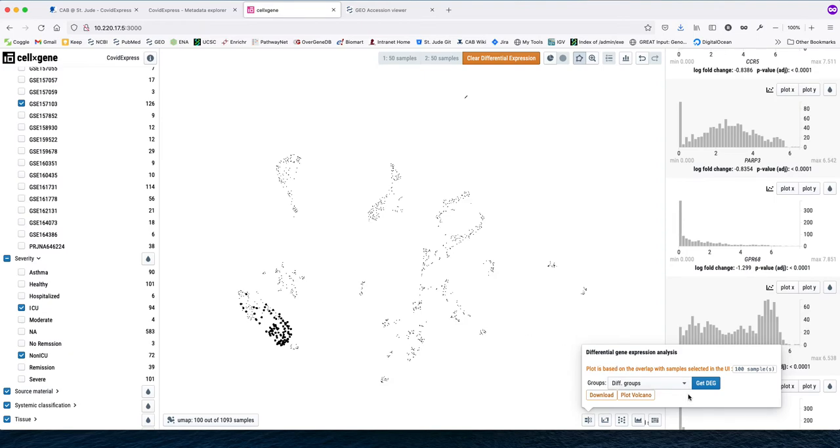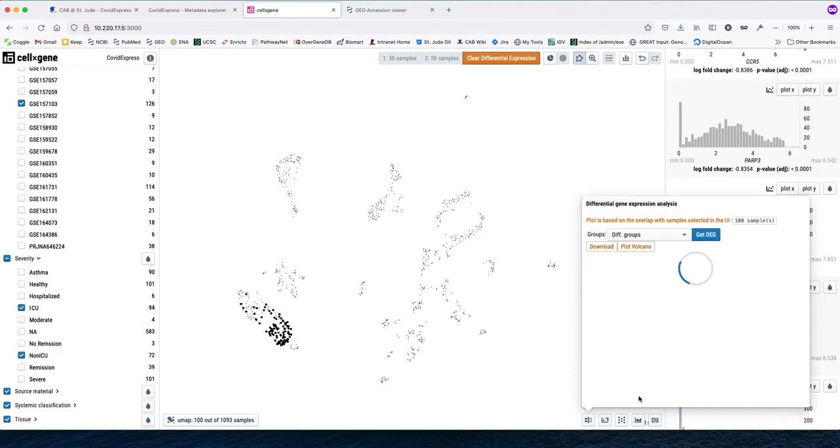Anyhow, we have this. Nothing popped out, except for 2 buttons, but the data is there already. So we can click this button, plot volcano, which will show the volcano plot in a minute. Essentially, those plots that we provide in the portal are in SVG format.